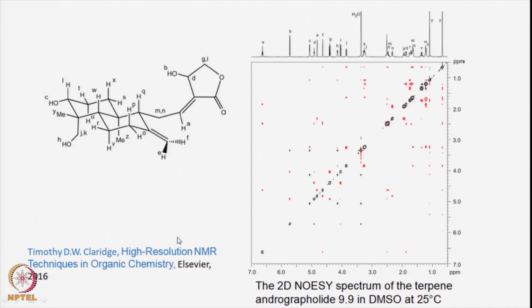So therefore, we have discussed here the important application of the NOESY with regard to the structure determination of molecules. While this is an important thing from the application point of view, we also demonstrated how pathways can be selected by appropriately choosing the phases of your pulses and the phases of the receivers, adjusting them so that you select what you want in your spectrum.